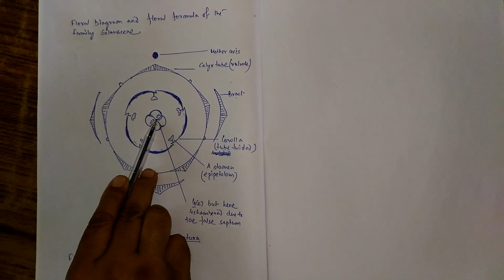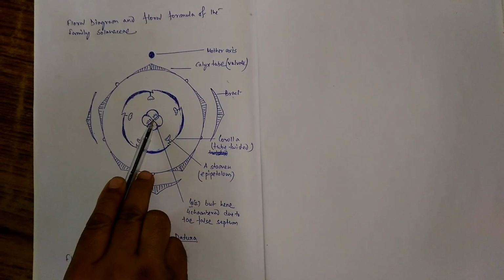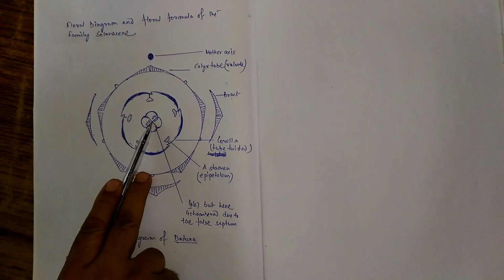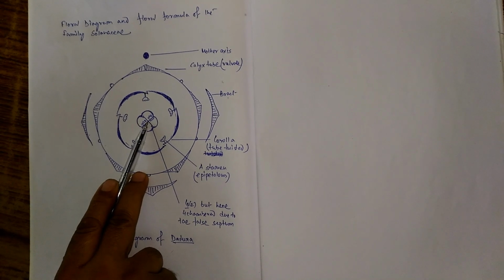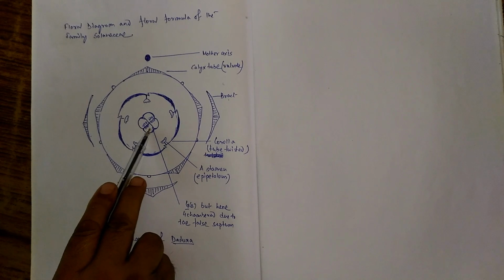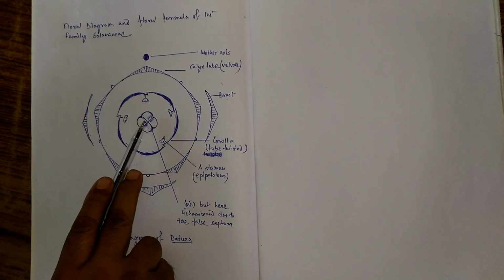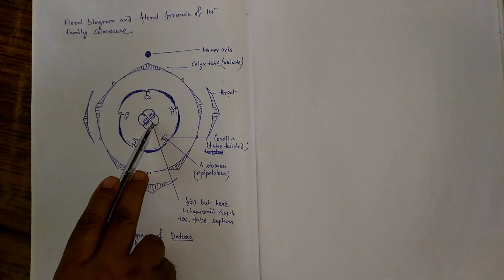Now this one is the gynoecium, that is transverse section of the ovary. Actually it is 2-chambered, but due to the formation of false septum it appears 4-chambered. And placentation is axile. The solid placenta is obliquely placed, that is maintaining an angle to the mother axis.